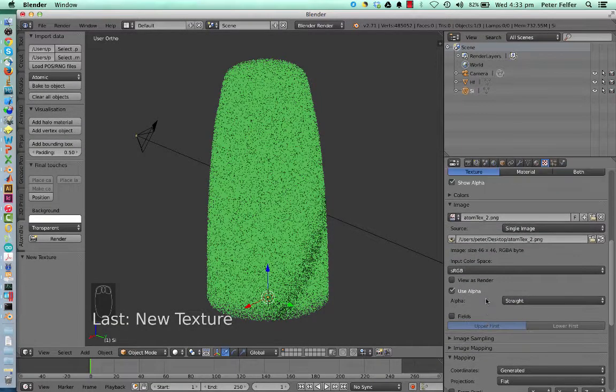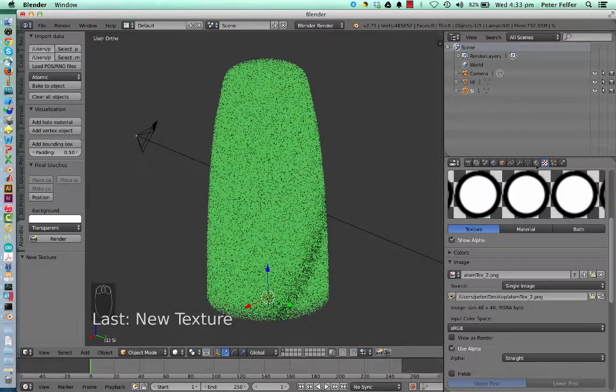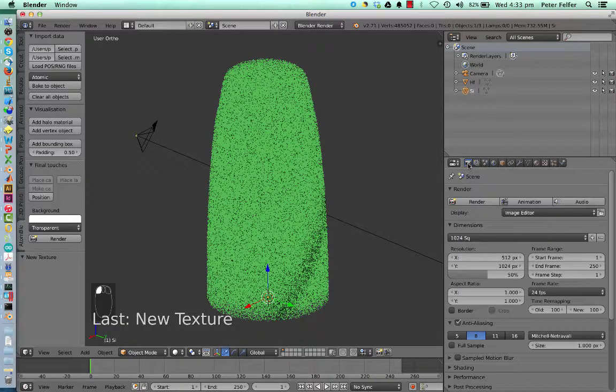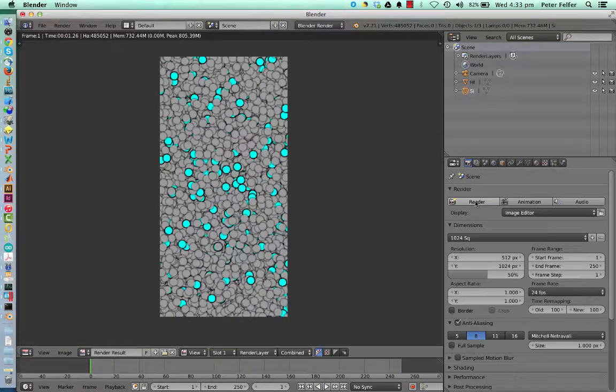And so once we've adjusted all of that, we actually have arrived at the exact same location that we were with the automatically generated material. Just wanted to understand how to do that, because you might have a reason to use a different kind of image, a different kind of texture, and it's not particularly hard to actually do that. Now you can see it's all there.